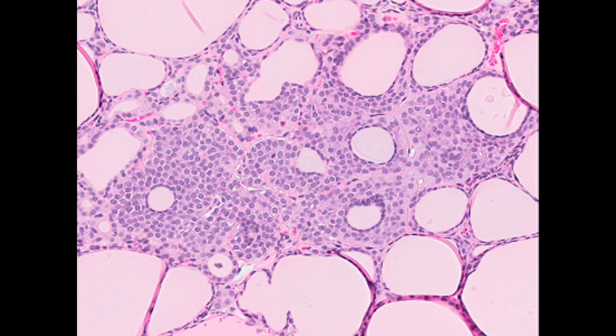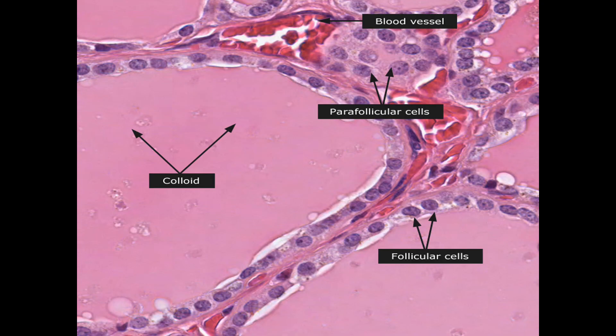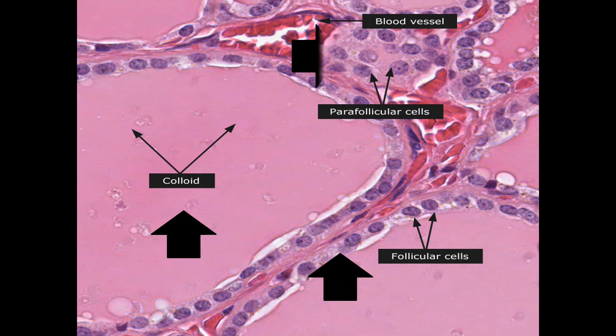This picture shows the follicular cells which stain more intensely, the colloid, and the parafollicular cells which stain less intensely. Another picture also shows the colloid, the follicular cells, and the parafollicular cells.